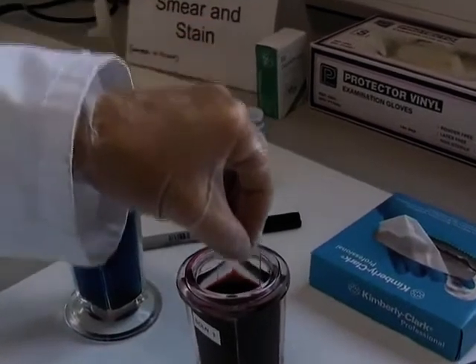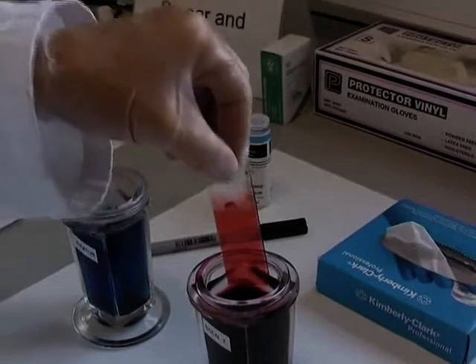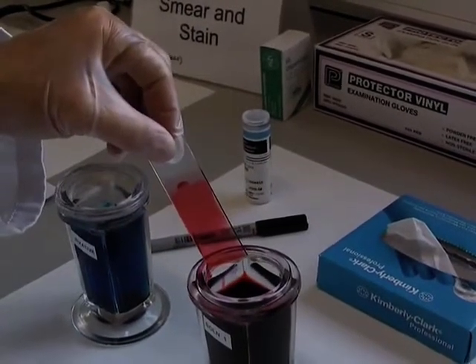And again into the second fixative: one, two, three, four, five. Allow the excess to drain.